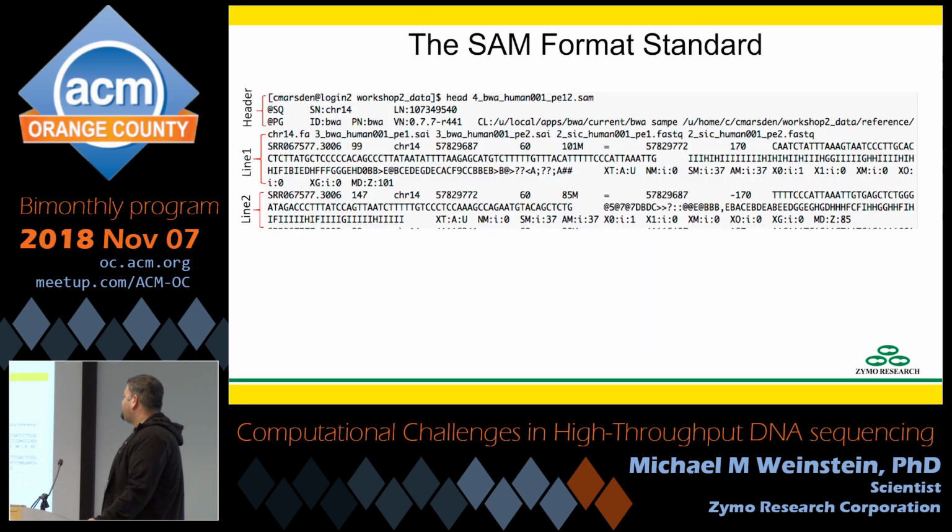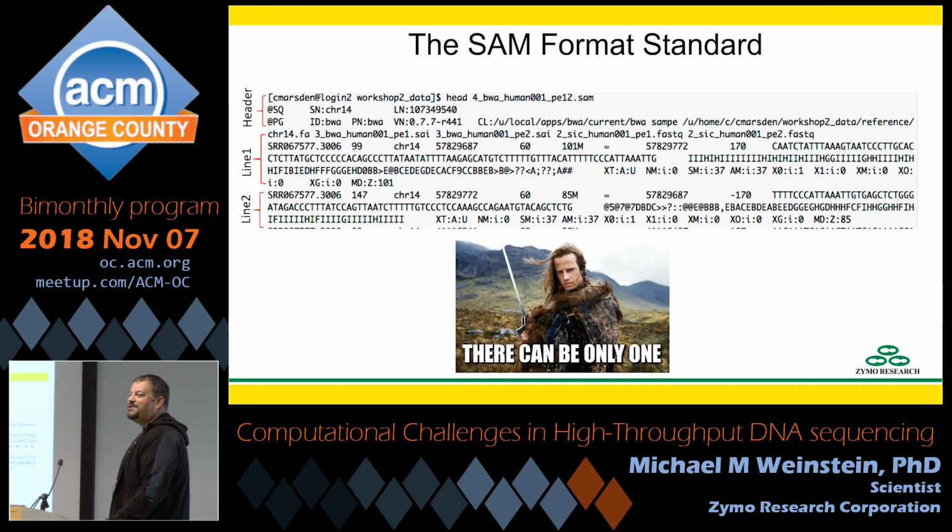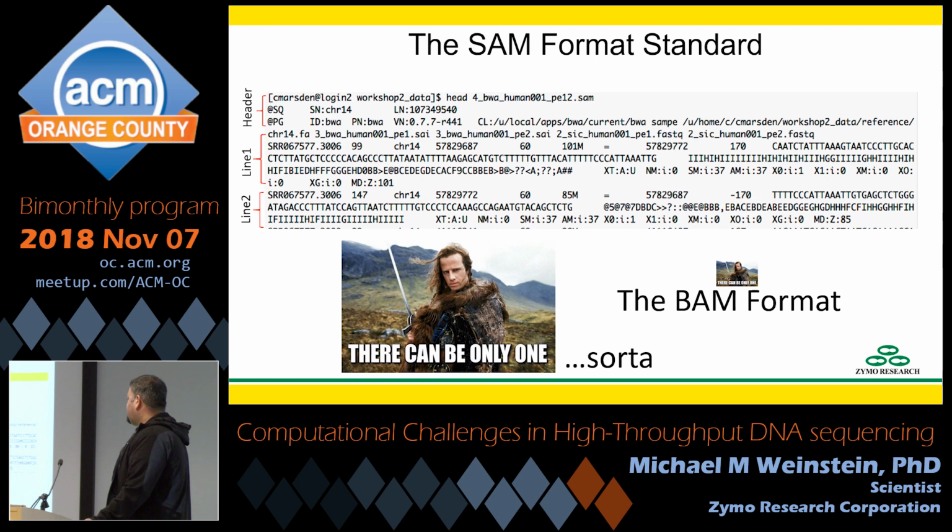All right, once you have your alignment done, you usually get back something in the SAM format standard. This is kind of nice. There can be only one. So the SAM format is pretty much what you get back aligned DNA reads in. You may do other stuff with them and move them into other formats to hold other pieces of data. But in general, if you're getting back just aligned DNA sequence, it's going to be in the SAM format. And in this case, there is only one format that I see being used widely.